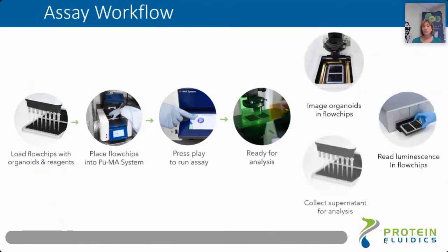And it can be used for fluorescence-based imaging. You can use different types of microscopes or high-content imagers. It can be used for luminescence readout using plate readers, or you can collect samples if necessary for downstream analysis, for example, for metabolomics profiles.